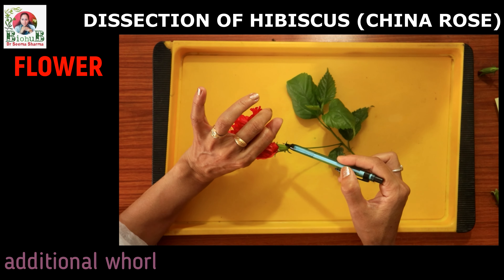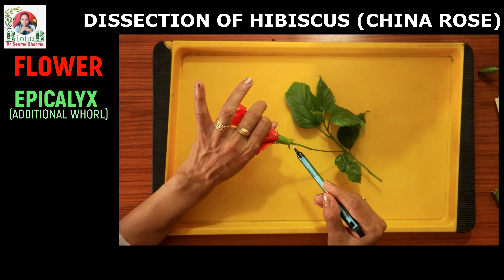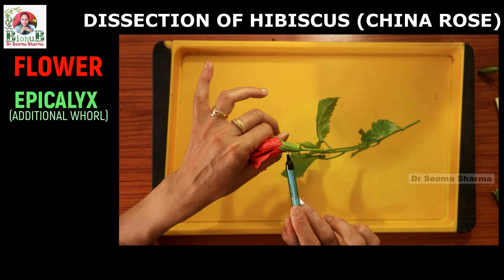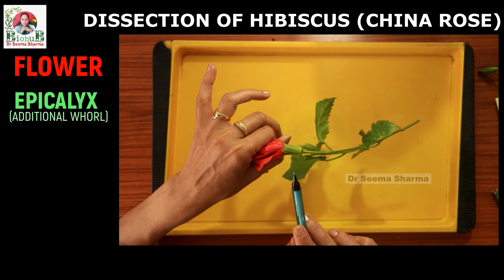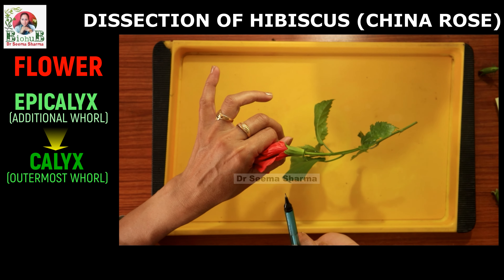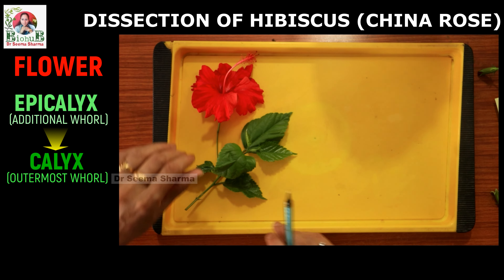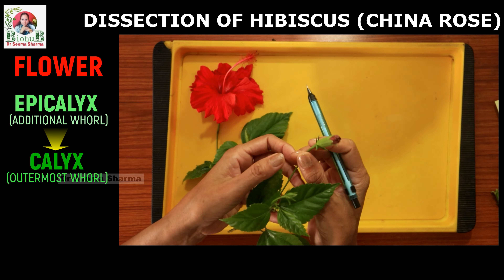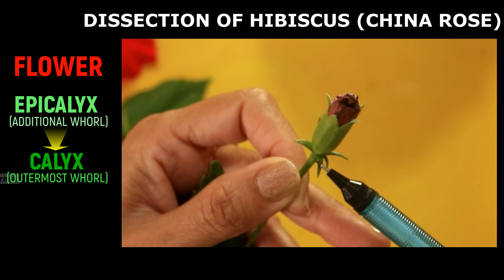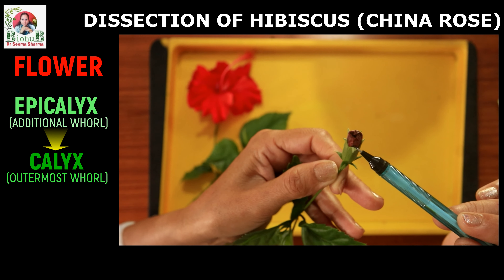Near the base of the receptacle of the flower, you will notice an additional whorl of tiny green leafy structures. They are called the epicalyx. These are actually the modified bracteoles. Above the epicalyx lies the actual outermost floral whorl of the flower called the calyx. To recognize and see the relative position of epicalyx and calyx, look at this unopened young flower. The lower whorl of green leafy structures is the epicalyx and the upper larger leafy structure is the calyx. Calyx protects the flower in the bud stage.